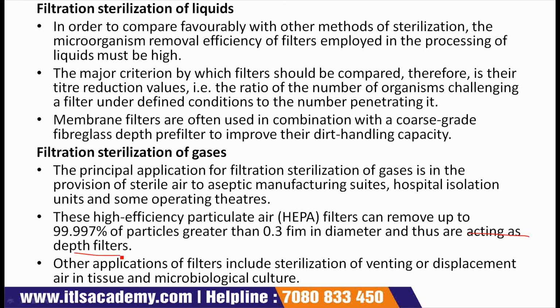In these HEPA filters, air is forced through HEPA filters by blower fans, and pre-filters are also used to remove larger particles to extend the lifetime of the HEPA filter.